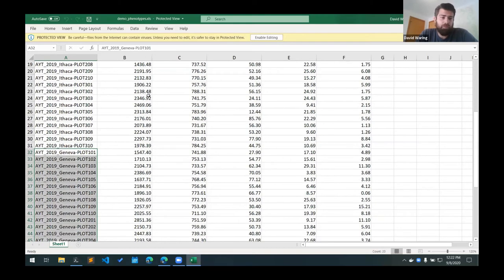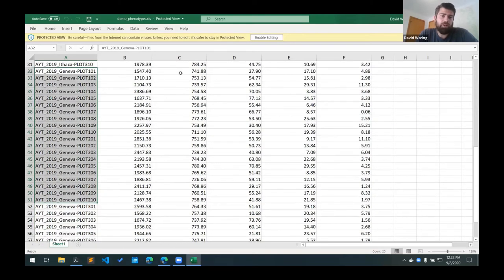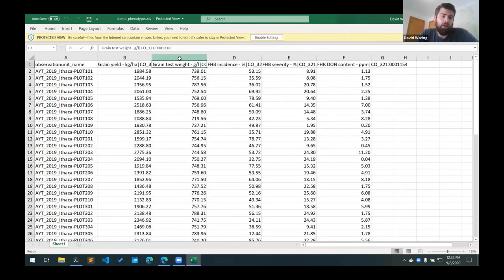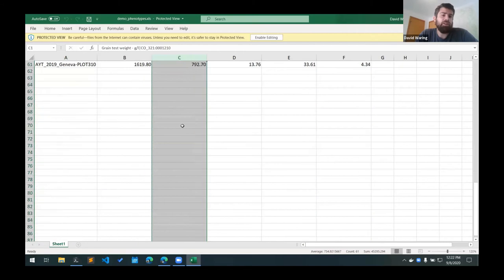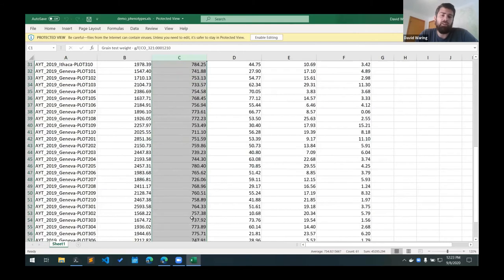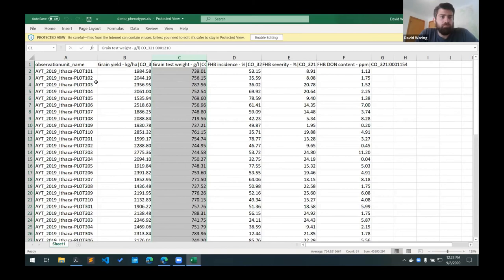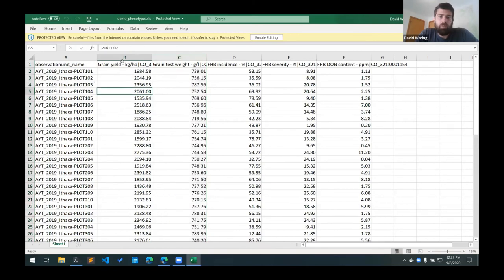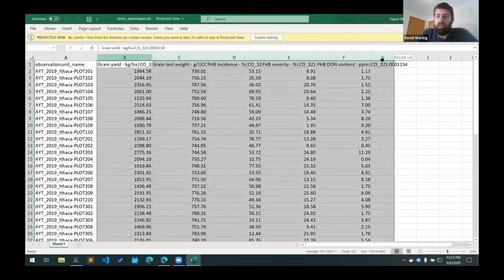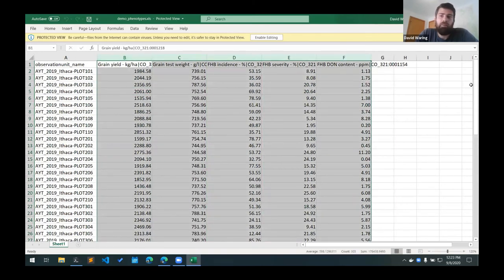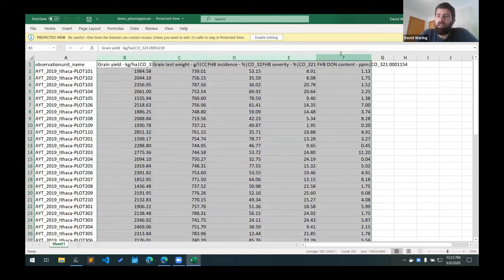And if for example you measured test weight in one location and not the other, you can just leave the values blank for that second location. So we have a column here for each of our traits and the plot names in the observation unit name.